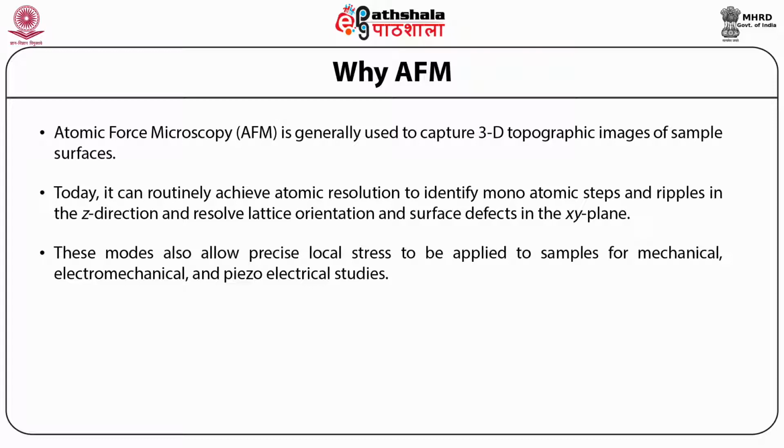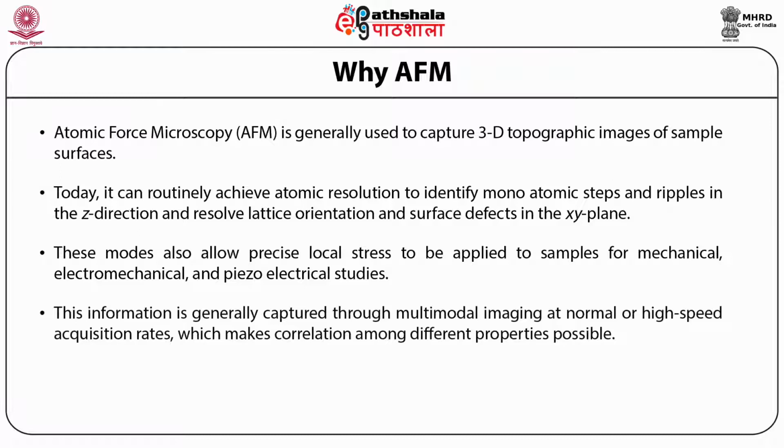Advanced AFM modes allow researchers to capture maps of modulus, adhesion, deformation, conductivity, surface potential, permittivity, optical absorption and reflection, electrochemistry, etc. This information is generally captured through multimodal imaging at normal or high speed acquisition rate, which makes correlation among different properties possible. In addition, AFM works not only under ambient condition but also in controlled environments including liquid, varied temperature, dry box, vacuum, etc.